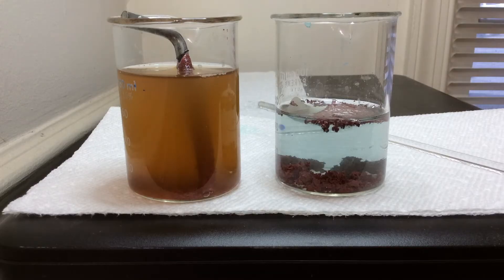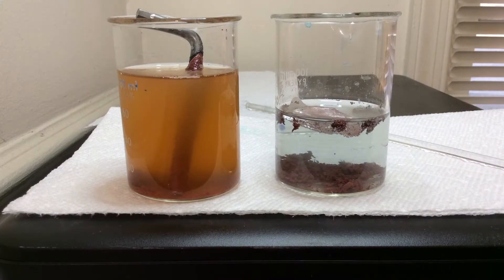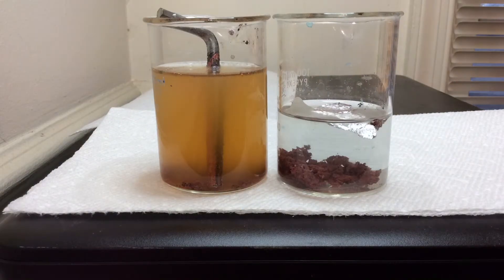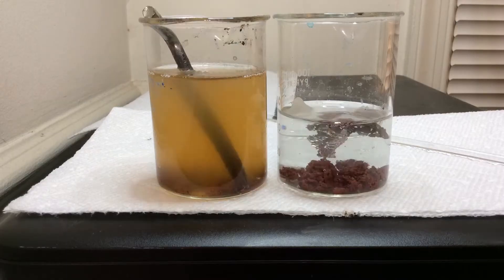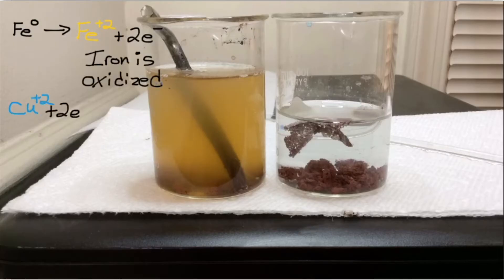The solution on the right is colorless because aluminum ions are being produced and they are colorless in solution. You have to be really patient because the reaction with the iron actually takes at least 24 hours to fully complete. To summarize: the neutral elemental iron is oxidized to the yellow plus-two ion, while the copper(II) ions — blue in solution — are reduced to elemental metallic copper.